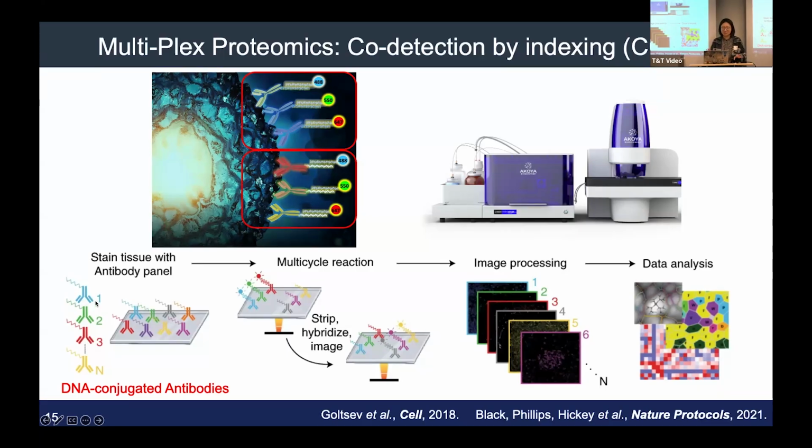And there's no secondary antibody. So in the first day, you incubate like 20 or 40 primary antibodies conjugated with the DNA oligos with your tissue. And then on the second day, we put the tissue onto the machine. This machine has vacuum chambers and microfluidic channels so that you can have directed flow with specific wash buffer or reagents you define in those bottles. And then every cycle, we can put the complementary DNA barcode with the fluorophore to detect 3 different antibodies at a time.